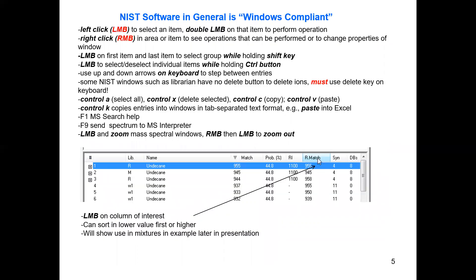The NIST software in general is very Windows compliant. Today we'll be using the Control key and then the left mouse button to select multiple things that you want to either delete or put somewhere else in another part of the program. You can do more than one entry at a time using the Control key and the left mouse button to select multiple entries.